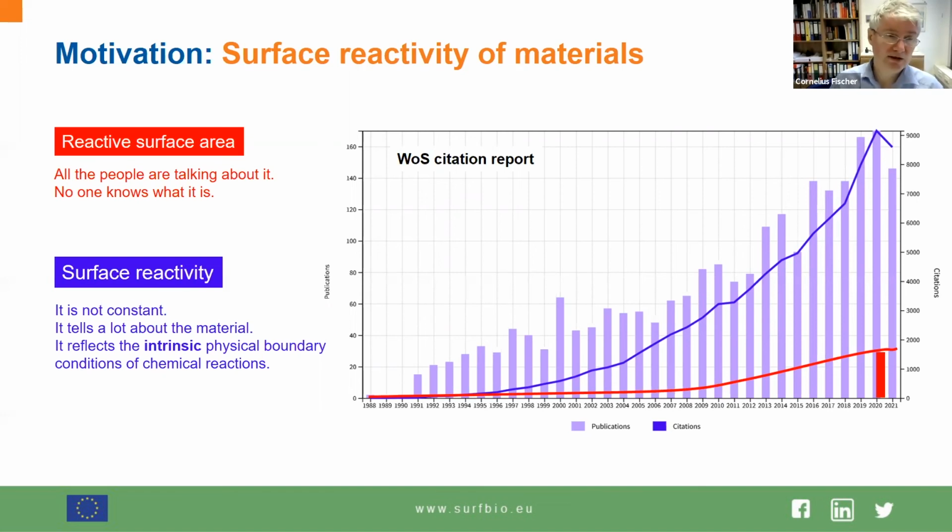And now I come back to the initial statement where some researchers in the US and in Japan took advantage of this surface-sensitive method. They started to analyze directly what's going on at crystal surfaces with the surface-sensitive method. And based on these fundamental investigations, 20 years ago, the concept of surface reactivity analysis came up fairly quickly.